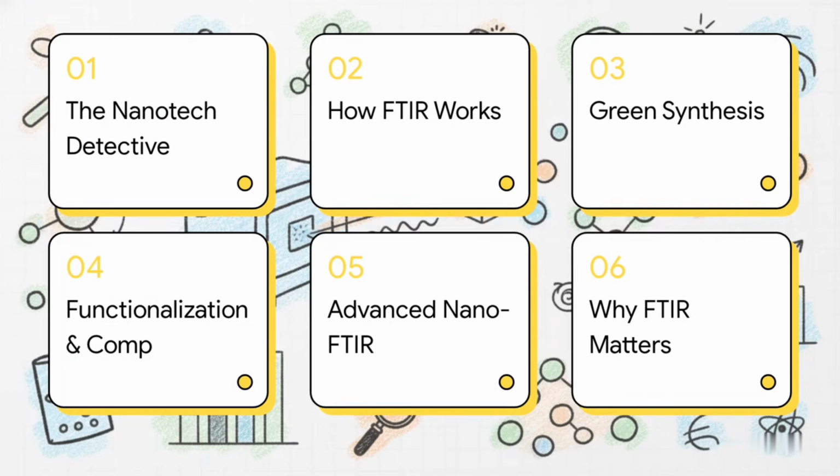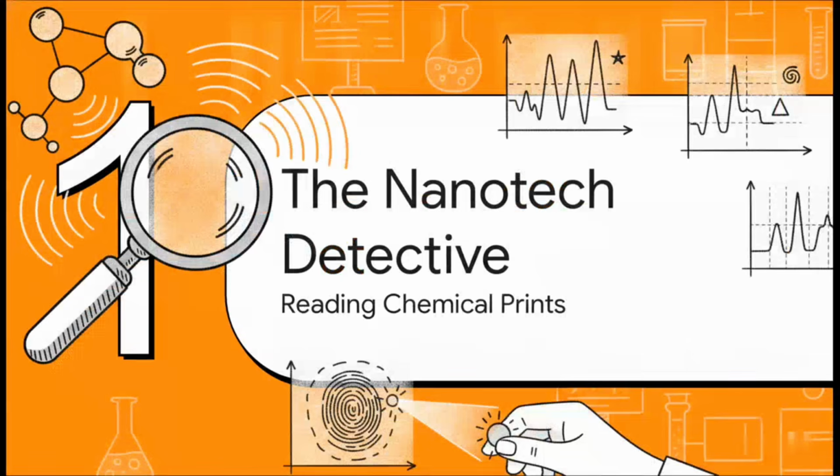Okay, let's dive right into this explainer. Here is our roadmap for today. We'll start by looking at the nanotech detective. Then we'll break down how FTIR works, explore green synthesis, dive into functionalization and composites, check out advanced nFTIR, and wrap up with why FTIR matters. Starting with Section 1, the nanotech detective.